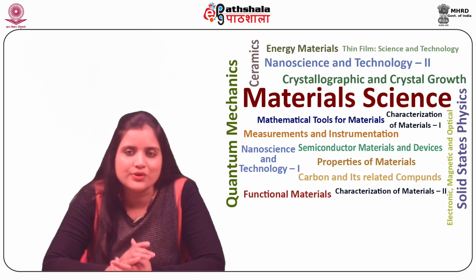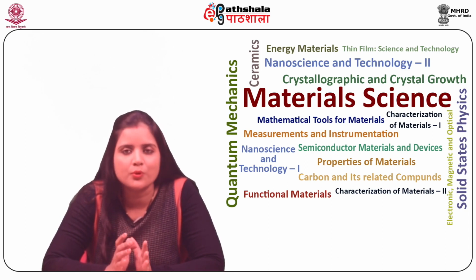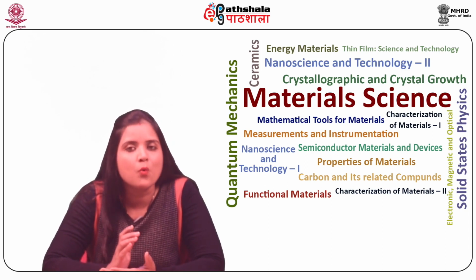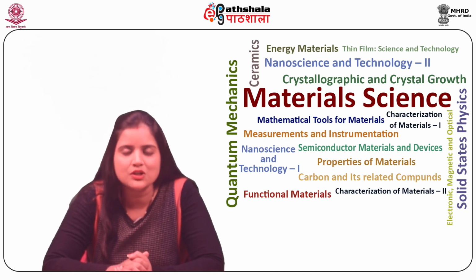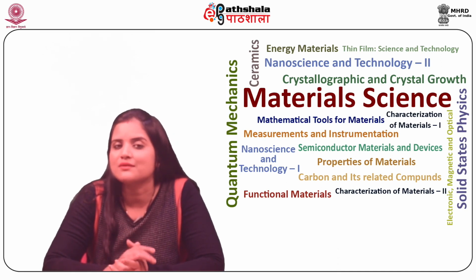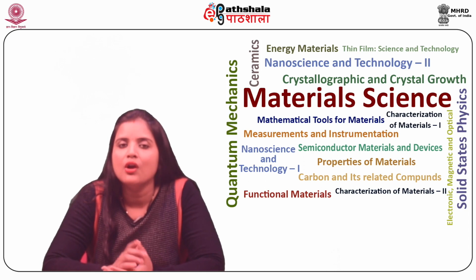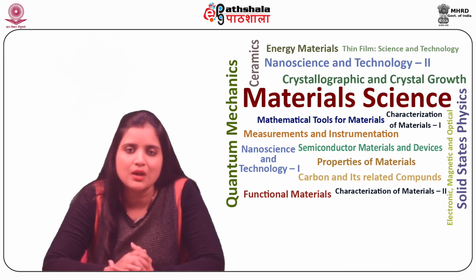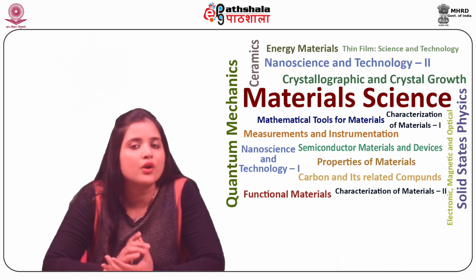His remarkable instrument included a glass needle probe with a sub-wavelength aperture, evaporated coatings to confine the light field, piezoelectric motion control, and a raster scan of images.